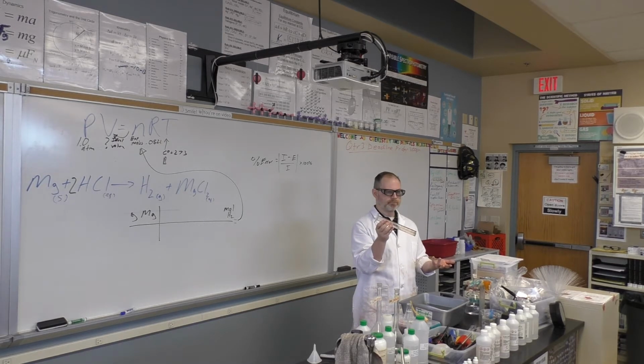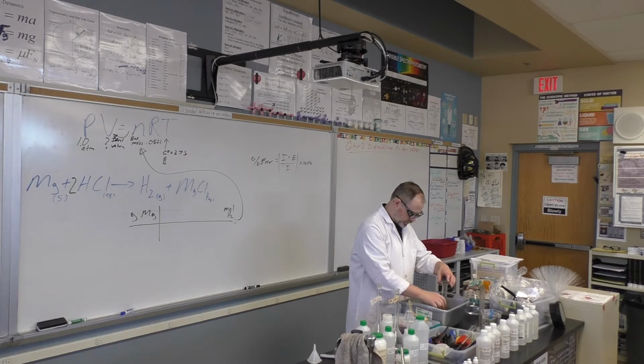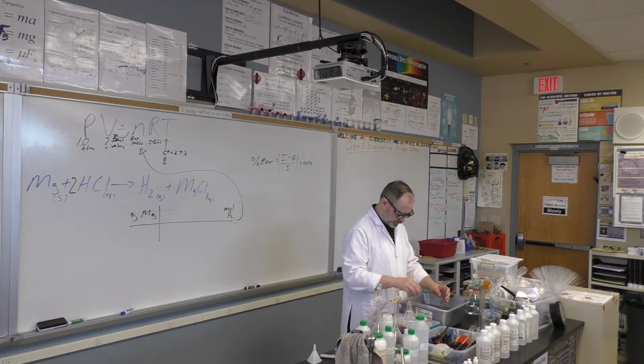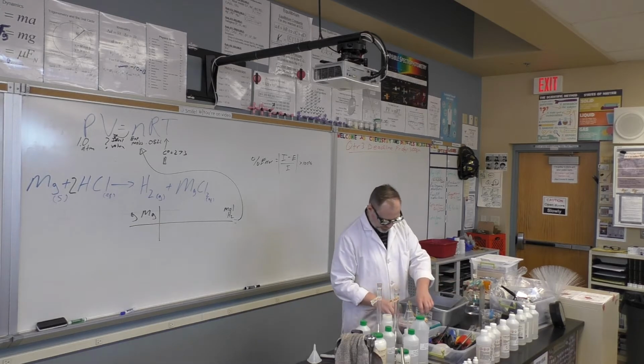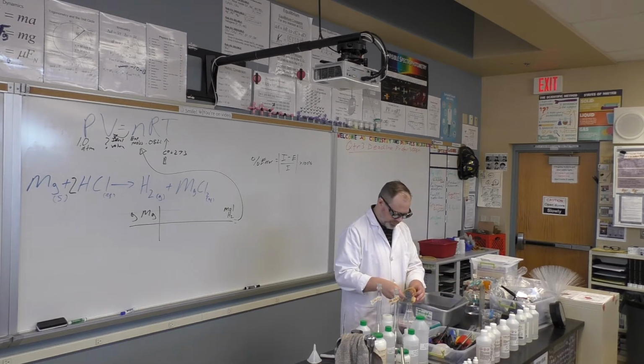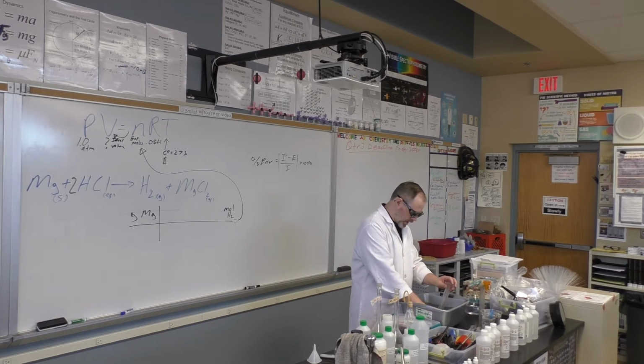All right, so water displacement: dunk it, fill it up, and hopefully one person does each thing. You're going to put the magnesium in the flask and capture the gas.